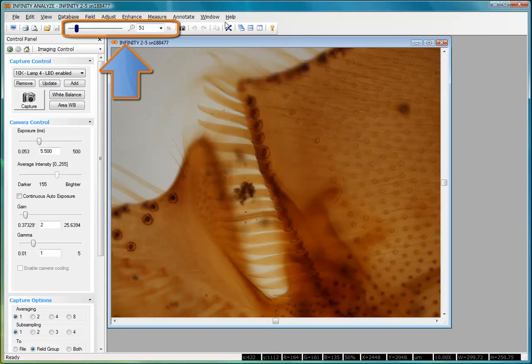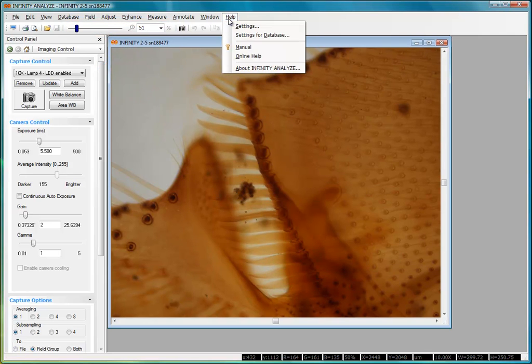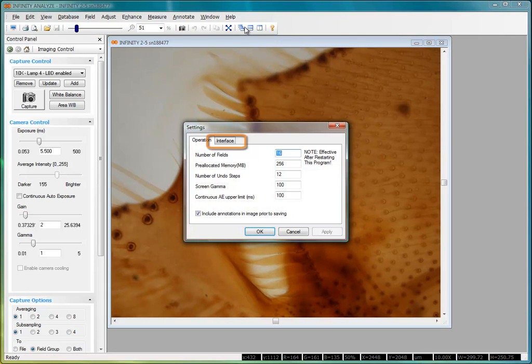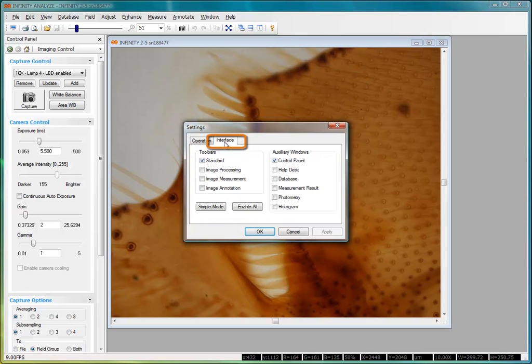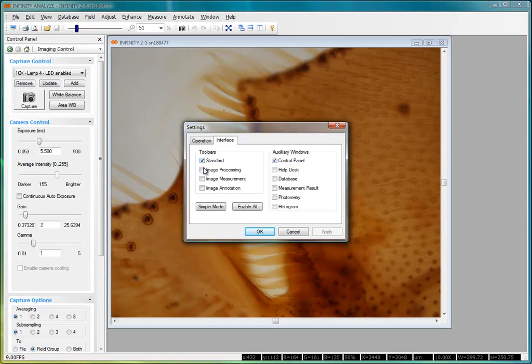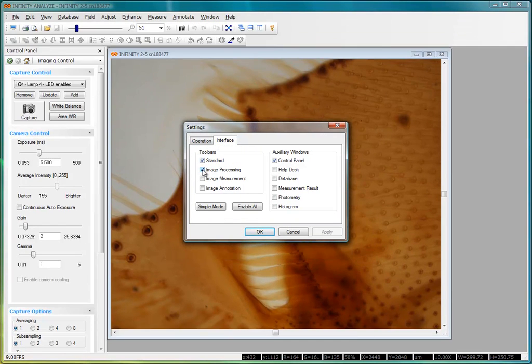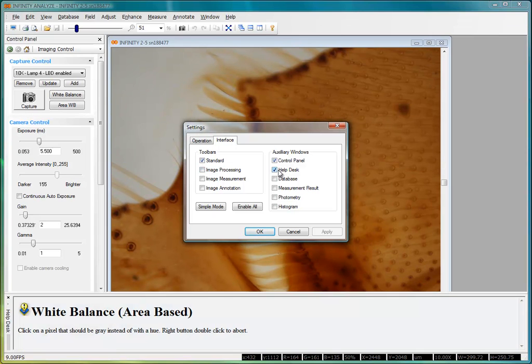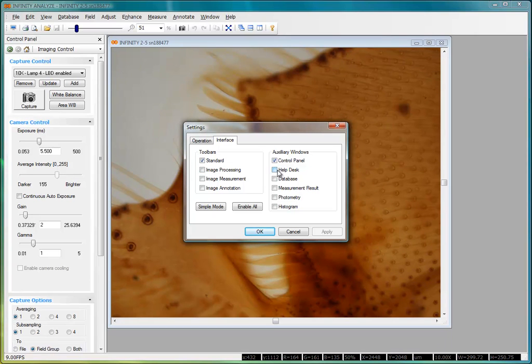If you haven't tried it before, with release 6.0.0, we've put the settings on the help dialog to allow you to control the user interface. So now you can toggle the individual items on and off and see their impact immediately.